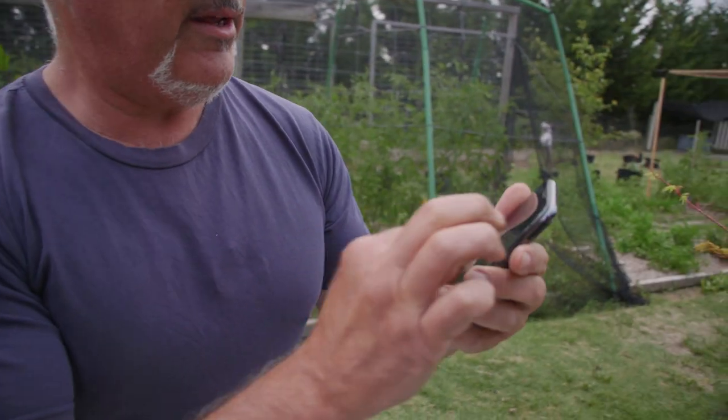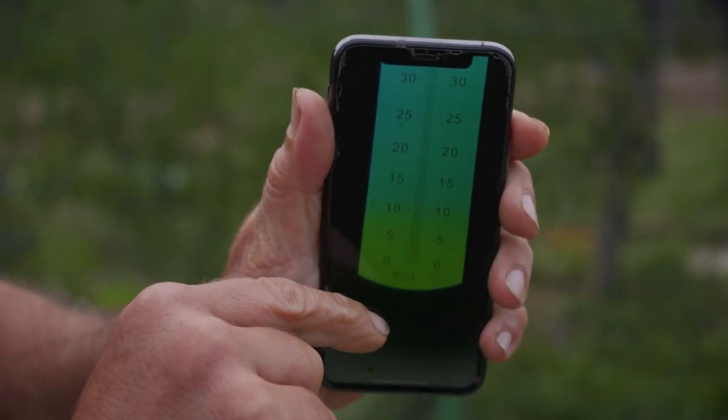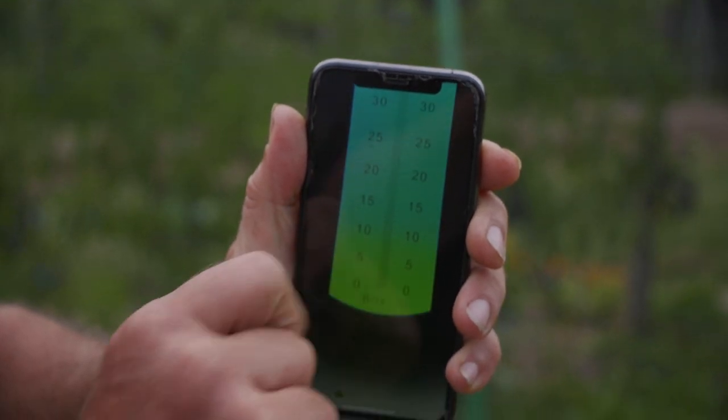Now it normally turns white. What you're looking at there - can you see that? Okay so you can see the discoloration there. So it's stopping around 8 or 9, just below the 10.